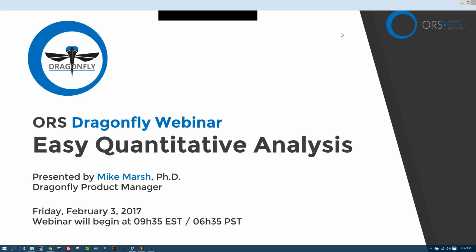What we're going to be talking about is how to do quantitative analysis on 3D images. I think what you'll see today is that there are features and strengths of the application that you might do in other applications, but the workflow is going to be so much easier in Dragonfly that you'll find that you become more productive. So let's go ahead and get started.